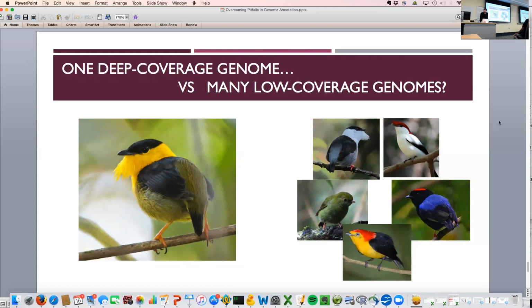What was the coverage? The PacBio that we got should be in excess of 10. We were shooting for 10x, and we got good recovery on all of those smart cells. So it's going to be in excess of 10x, but probably not 20x. That's based on recommendations of people that are focused on doing hybrid assemblies. Again, they do a lot of tweaking when they're doing the assemblies themselves. If you just use their software that you can download, it may not work as well.